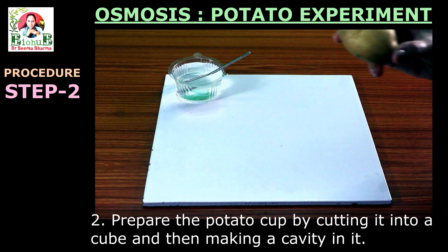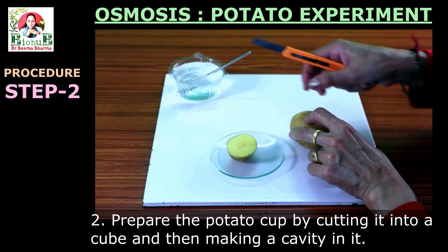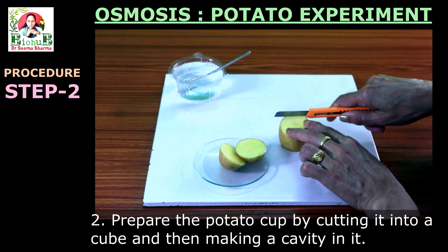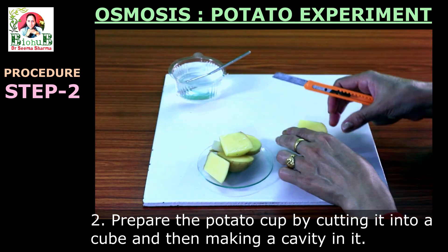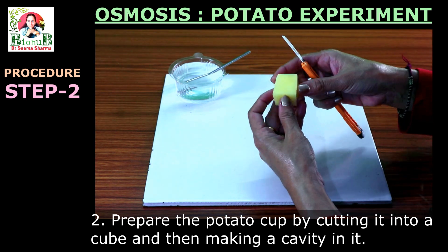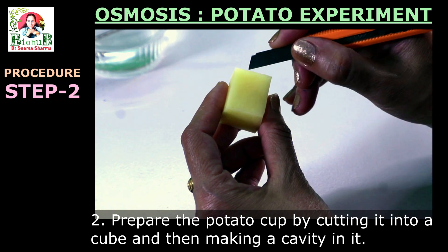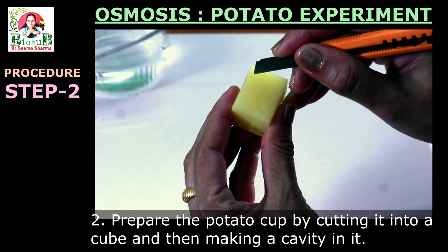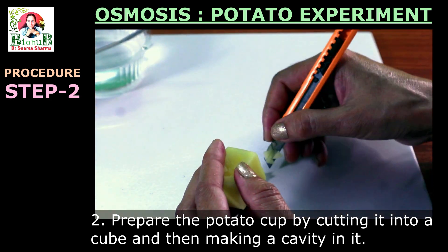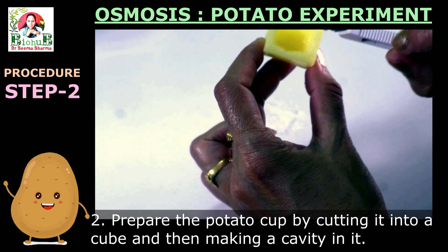Step two: preparing the potato cup. Take the potato and with the help of a cutter, cut and slice out a cube from it. Please ensure that the potato skin is removed while making this potato cube, as potato skin is made up of a dead and thick layer of cells which may interfere with the results as it slows down the process of osmosis. Scoop a deep cavity into this potato cube. Proceed very carefully and patiently to ensure that none of the sides or the base are ruptured or damaged. This cavity has to hold the 20% sugar solution, hence no leakage is acceptable. In case it does get damaged, take a new potato cube and start afresh.